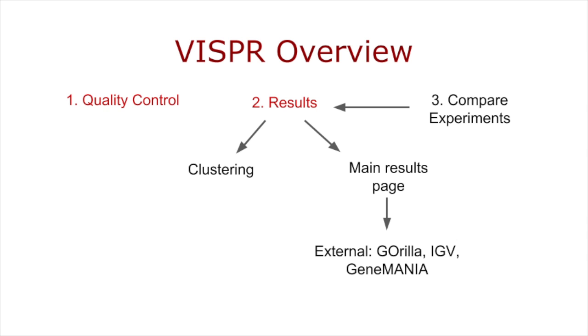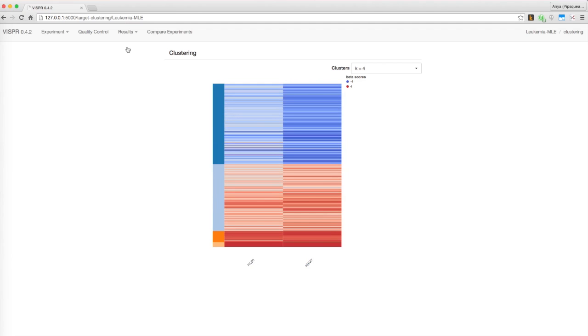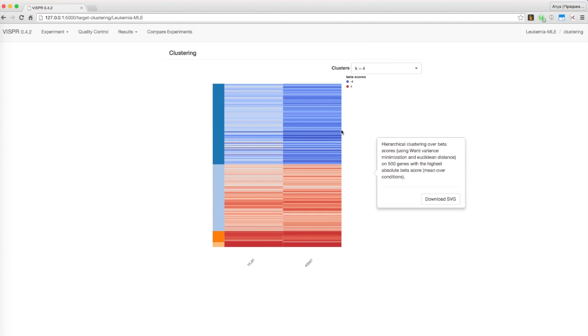First, let's explore the clustering feature. Every line on this visualization represents a single gene, color-coded by its essentiality according to MAGIC's new gene ranking algorithm, MAGIC-MLE. Positively selected genes are red, and negatively selected ones are blue. The more essential they are, the darker their color.